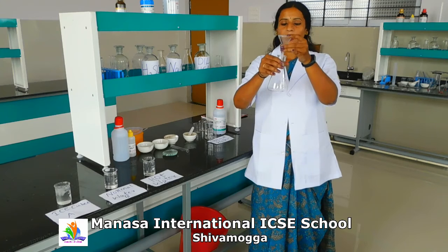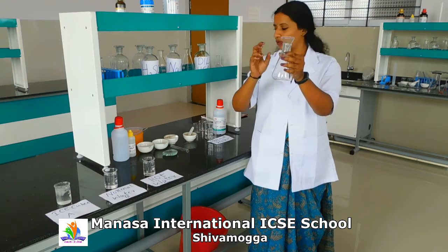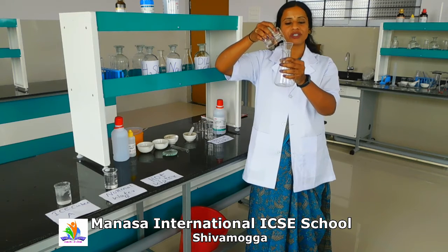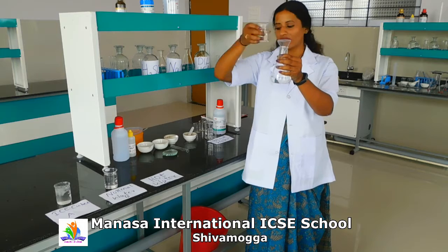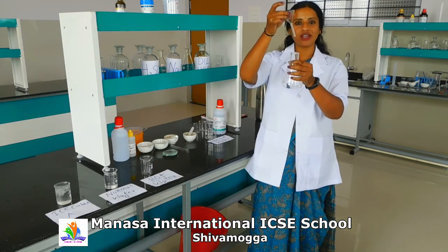Just to show you, the funnel will fit the conical flask, and you can pour water or anything without spilling out of the container. This is the benefit of this funnel. And this is the apparatus which we are going to use in the chemistry laboratory.